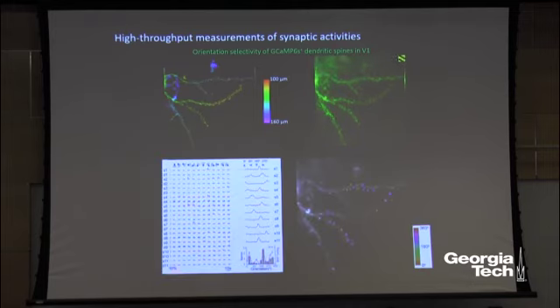We can analyze this data and identify the spine-specific input. For example, this spine is only activated at this particular orientation, but the nearby dendrite does not have any activity. Then we can ask what the preferred orientations of all the spines in this volume are, and in this way we can answer this type of question in a very high-throughput fashion.